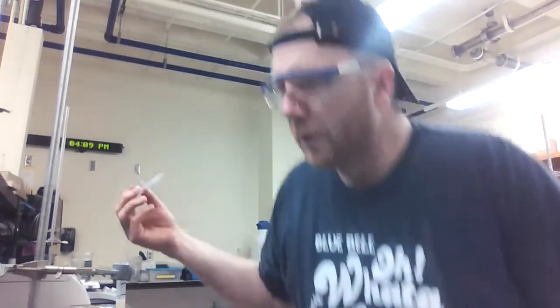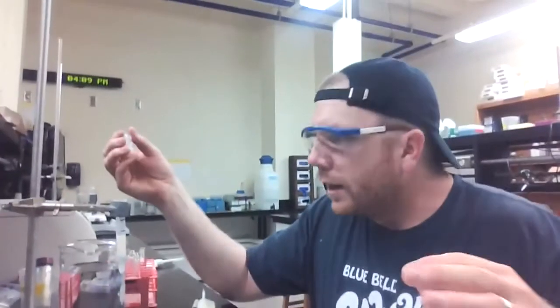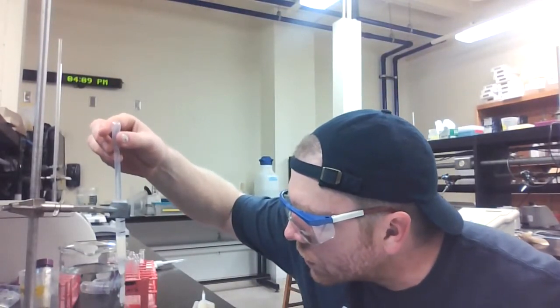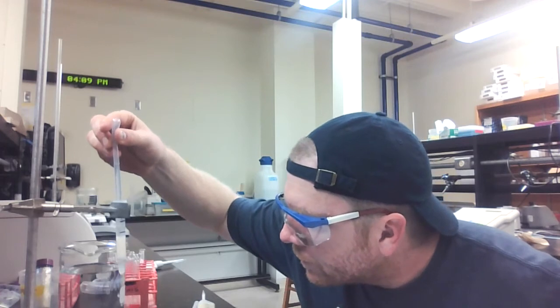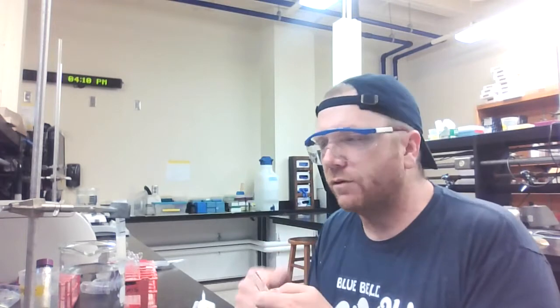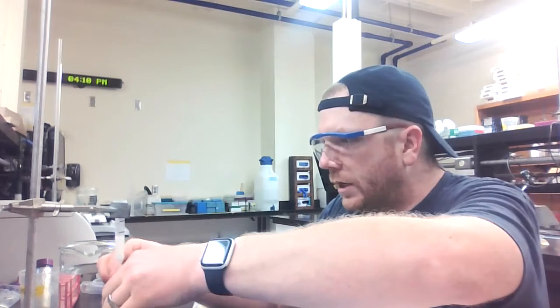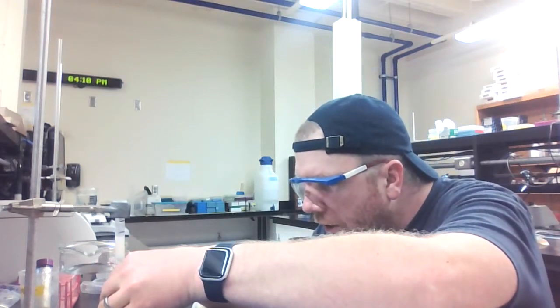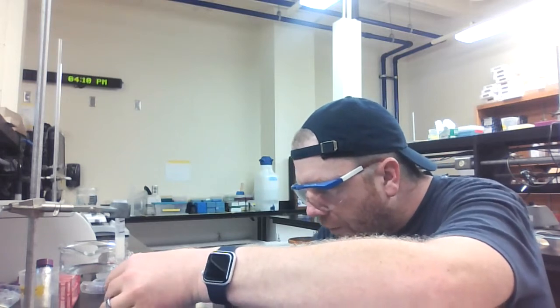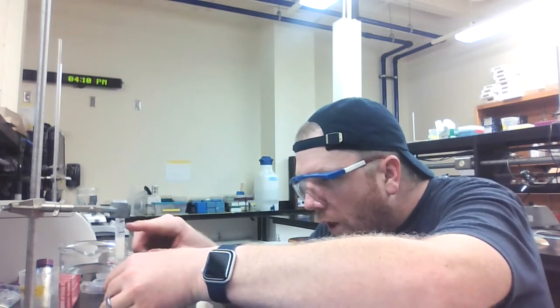which I have in another beaker, and I'm going to carefully add the elution buffer, which has my 0.25 molar sodium chloride. Add that. Okay, so now fraction number 18. Fraction number 18 should begin to have the influence of my sodium chloride in that solution. So I will collect. And again, I'm collecting approximately 1 milliliter. So I've got it marked off, and I'm watching up here.